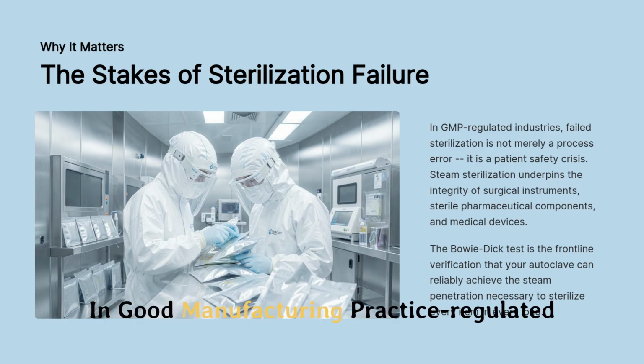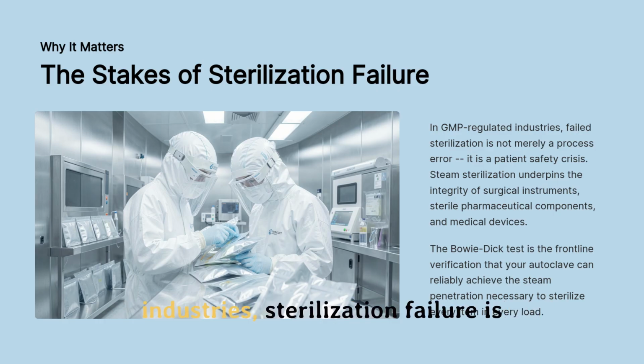In good manufacturing practice regulated industries, sterilization failure is a critical patient safety issue. Steam sterilization ensures the integrity of surgical instruments and medical devices. The Bowie Dick Test is essential for verifying that autoclaves achieve the necessary steam penetration to sterilize every item effectively.